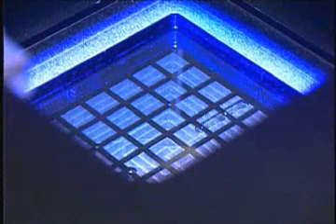We know that the pieces that are fluorescently labeled will stick tightly to the corresponding gene features, but they won't stick tightly anywhere else. So we rinse the chip off after we do the hybridization step.